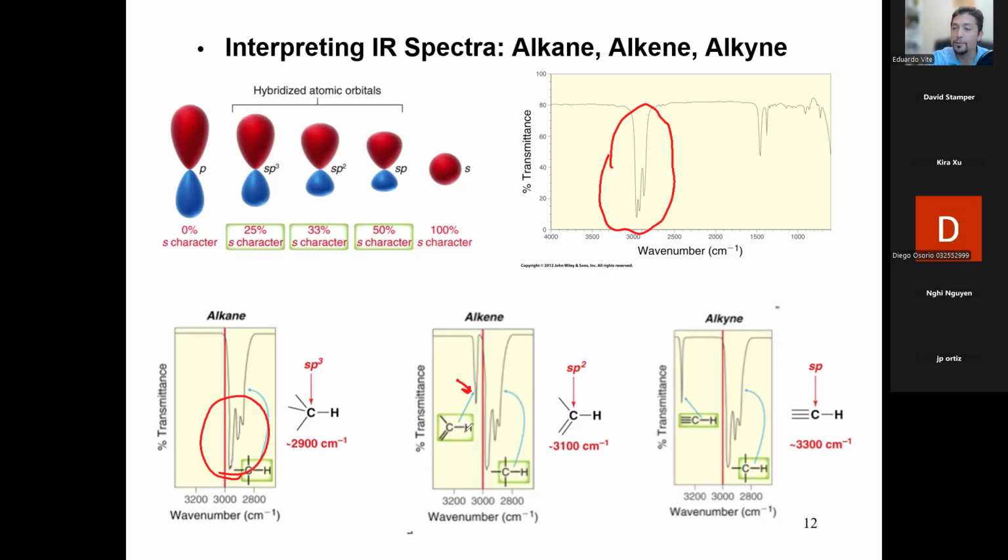That peak only comes from the carbon double bond. And then you see this sharp peak over here further away. Notice there is this distance right here. This one is specifically only from the sp carbon hydrogen bond. So this will tell you if it's a double bond or a triple bond, but even those still have all the stalagmites in there. These are everywhere. Every spectrum has this.